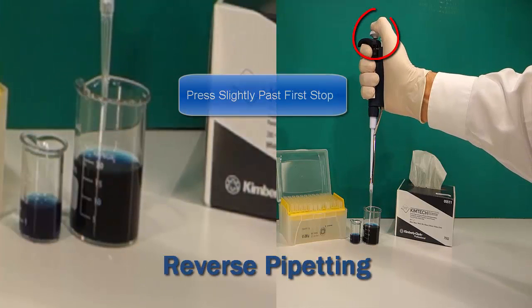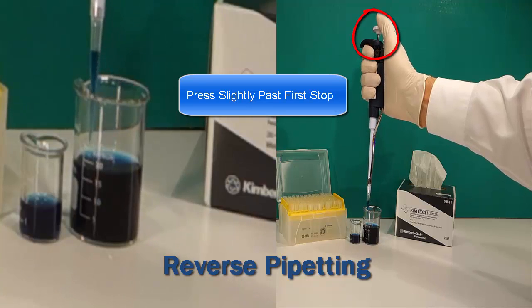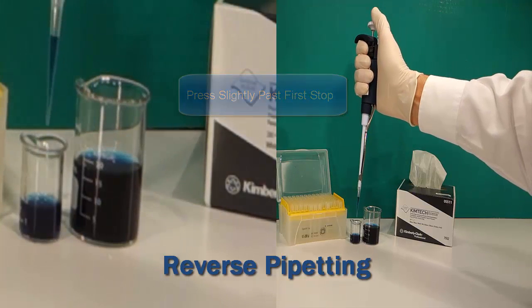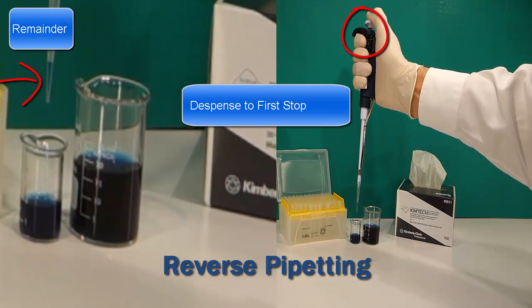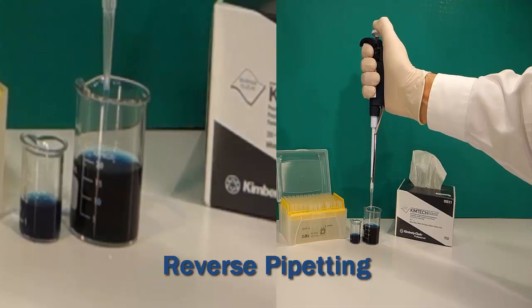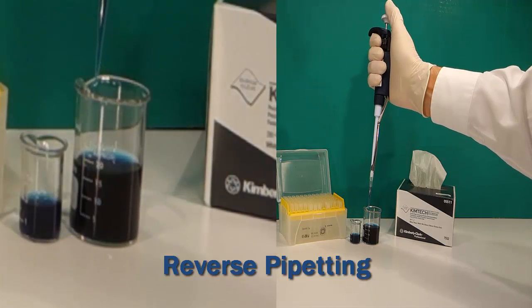To reverse pipet, push the plunger slightly past the first stop. Insert the tip in the liquid and slowly aspirate to the top. Dispense liquid to the first stop, leave the remainder in the tip, and repeat the pipetting cycle. Or leave the remainder in the tip to discard with blowout.